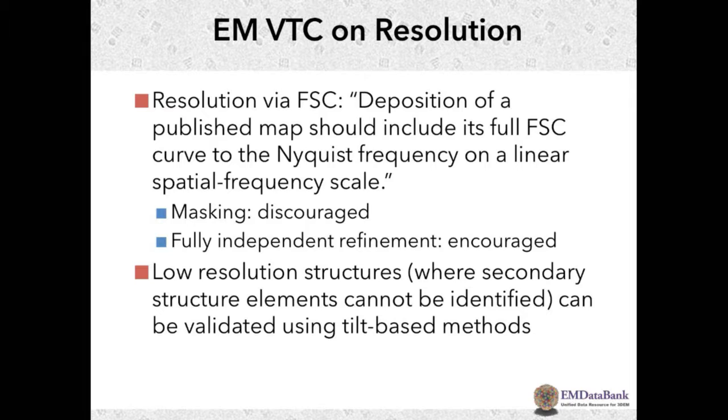But what if, let's say, the number people use seems kind of arbitrary, like 0.143 or something like this for the resolution cutoff. What if it has higher resolution as far as that number on the y-axis, but it just started sloping downwards earlier? Oh, you mean if the shape was not right, but if it was the sigmoidal shape? Slower decrease. Yeah. So higher resolution according to this 0.143 on the y-axis, but the shape was different. It started sloping downwards earlier, as opposed to a flat plateau.